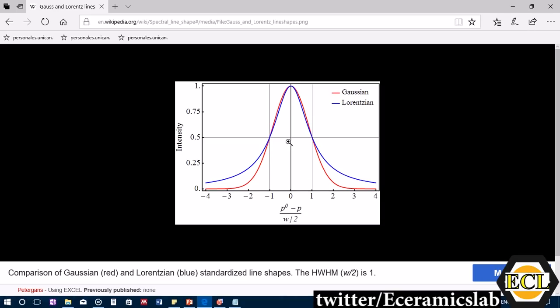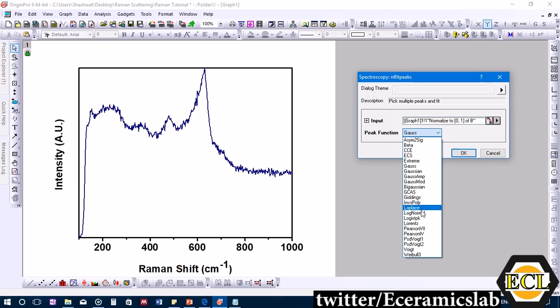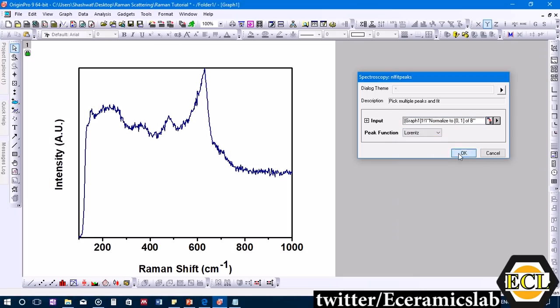Gaussian and Lorentzian curves are both symmetrical. The blue one is Lorentzian and the red one is Gaussian. You can use either one or a combination — it depends on what you want. In our case, we'll select the Lorentzian curve for the peak function.